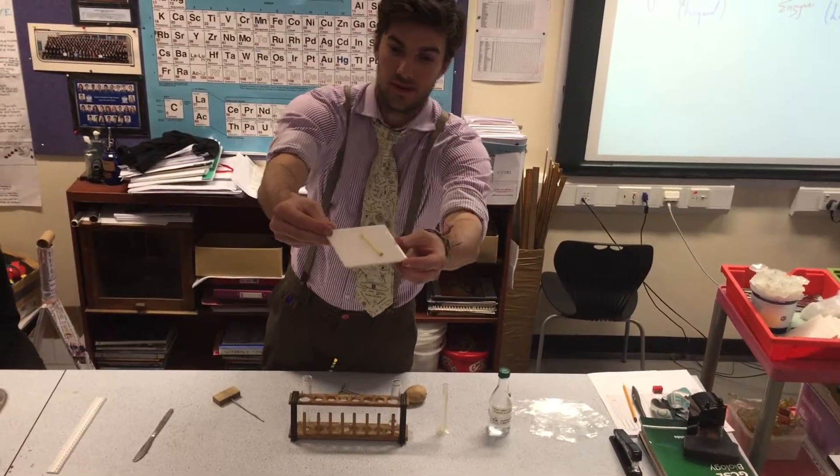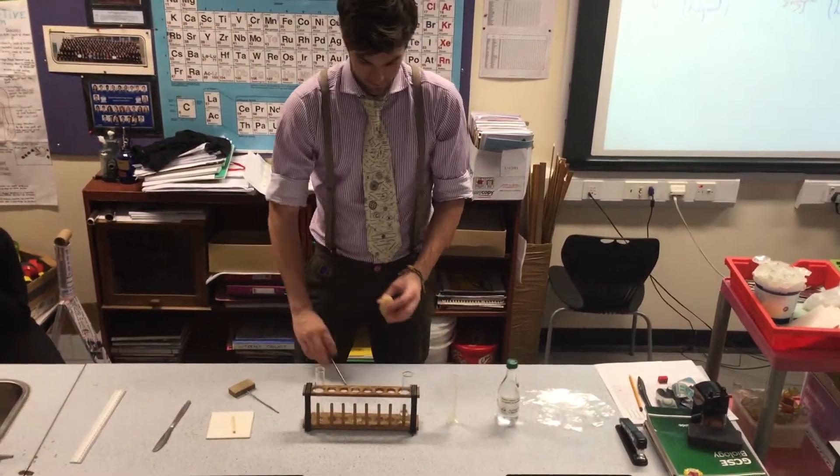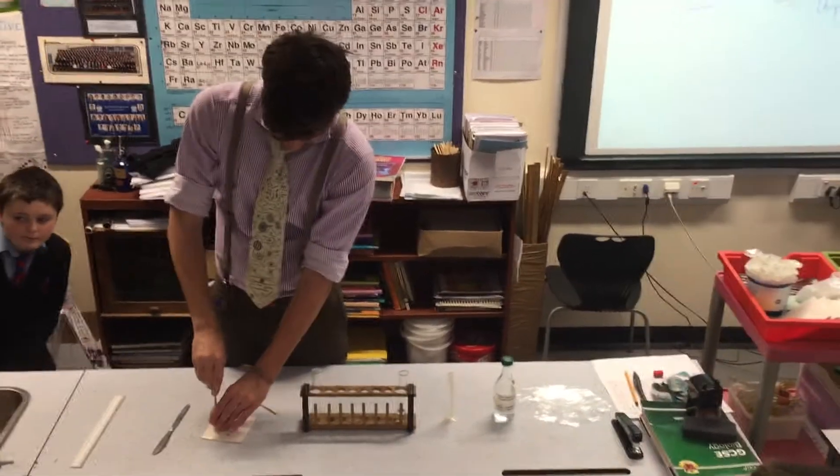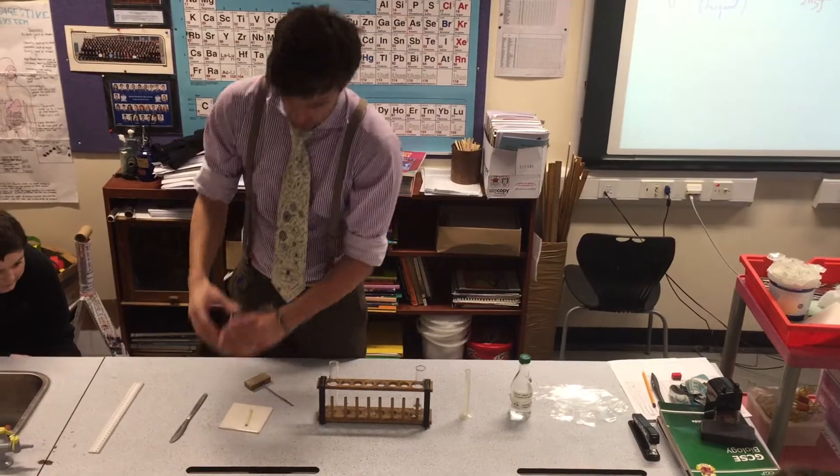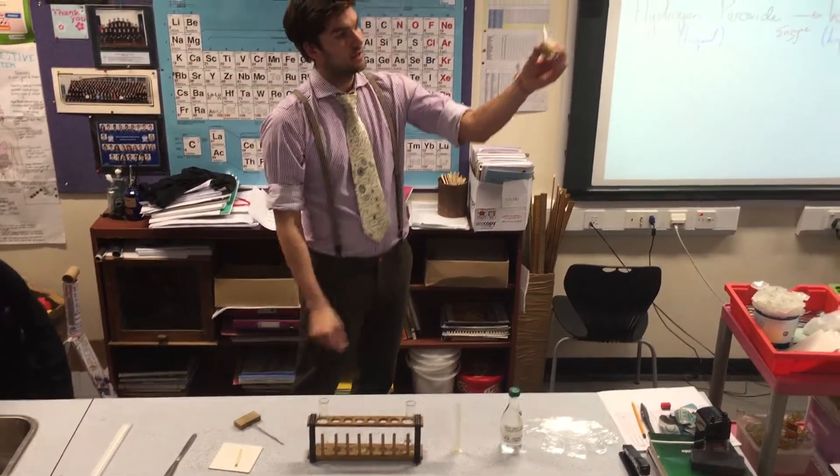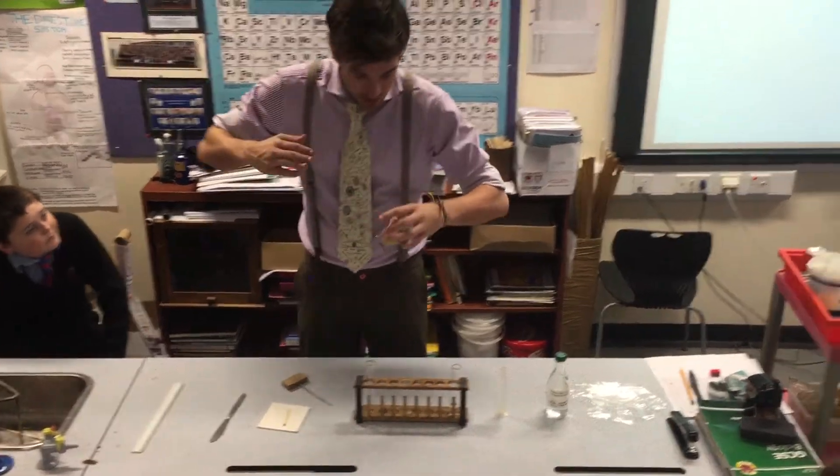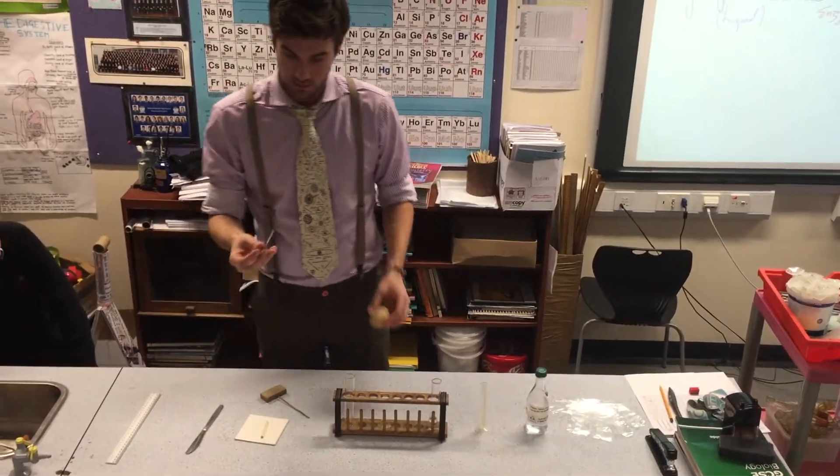Next, we need another length. So again, bore this onto the spotting tile, straight through the potato. The dangerous part is if you push it and your hand's on the potato, you're going to stab yourself in the hand. I don't want that to happen.